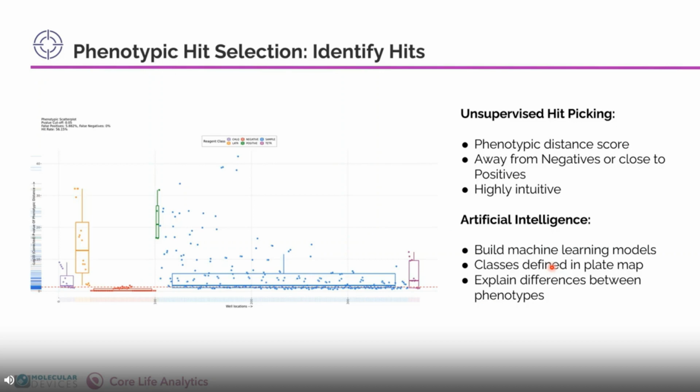The development of this AI model can then be applied to your growing number of images generated, where it can find hits based on the parameters that you set. As a matter of fact, nowadays, deep learning can take the step even further by applying trained models to carry out automated segmentation, feature extraction, and data mining to find the hits of interest.